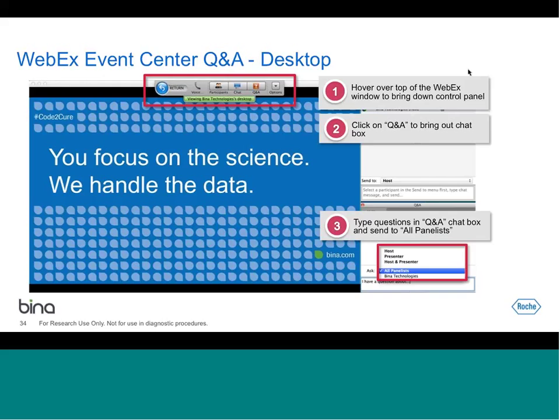Okay, another question. How did you determine your truth set for training? In other words, how did you know for certain that each false positive was in fact false and each true positive was true?